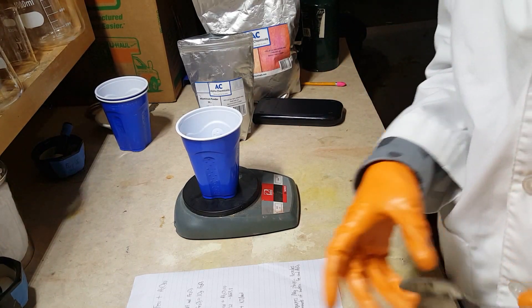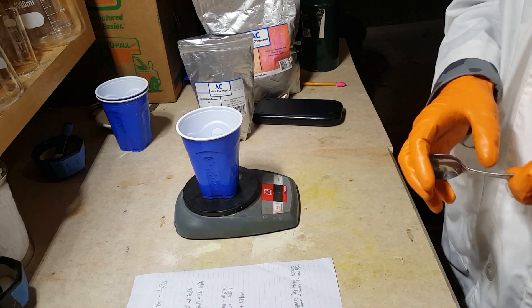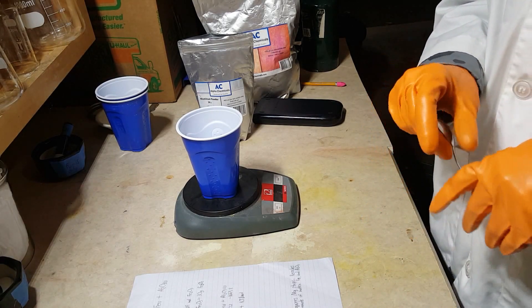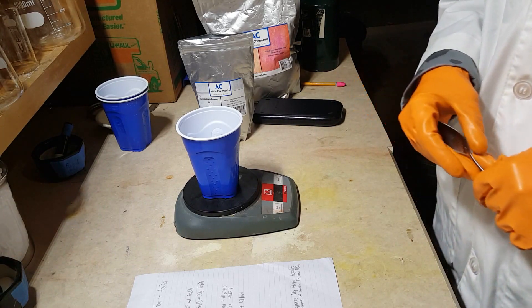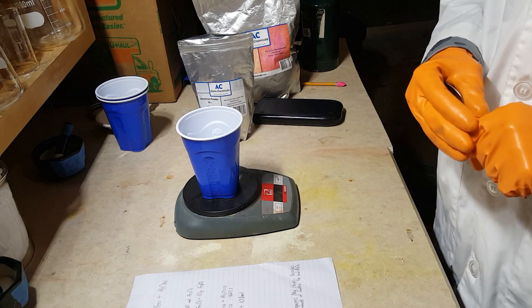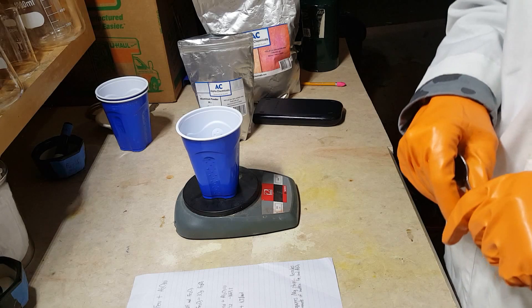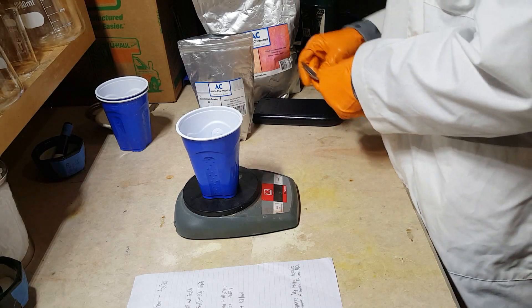According to my calculations, for every 1 gram of aluminum you're going to need 3 grams of iron oxide. So, for example, if you want to make 12 grams of thermite, you'll need 3 grams of aluminum and 9 grams of iron oxide. So, let's make some here.